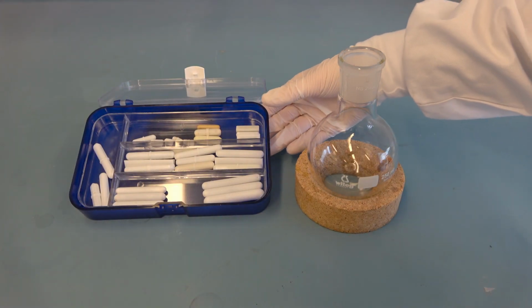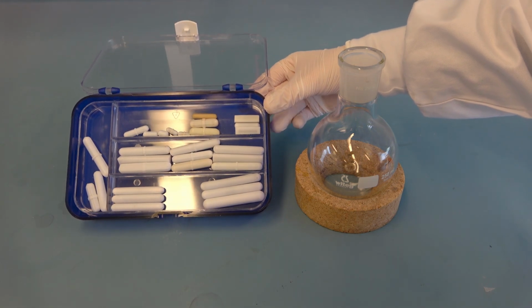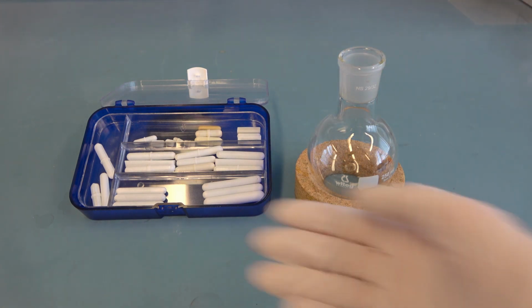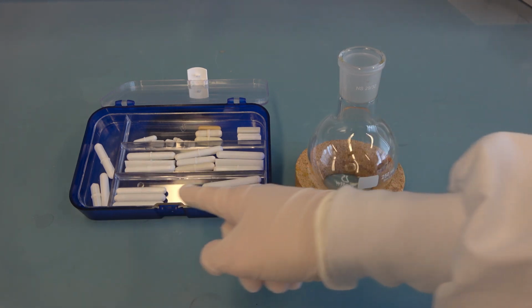Magnetic stir bars are usually octagonal or circular in cross-section. When choosing a stir bar, make sure to pick the right size. It should be large enough to provide efficient stirring, but smaller than the diameter of the glassware in use.